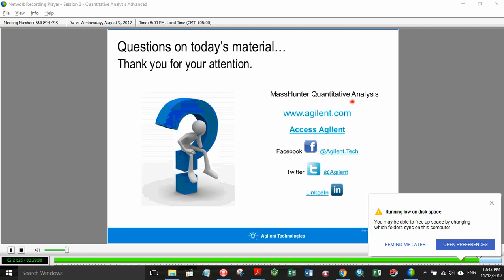For those of you who haven't figured it out yet, you can drop those questions into the Q&A box on our WebEx console, or you can, of course, press *1, and Alan will open your line. So let's go to the first question. I'm not sure if you can explain this or if you'll need to live demo this, but can you please expand on where to save a method to an independent file for later retrieval, other than just going back to previous batches every time? Howard.